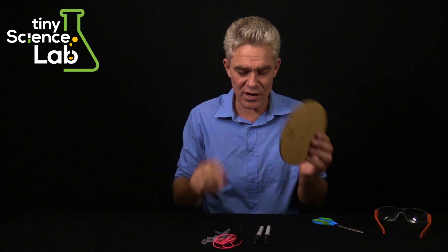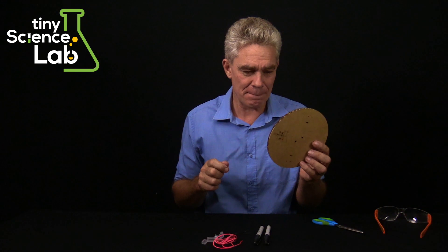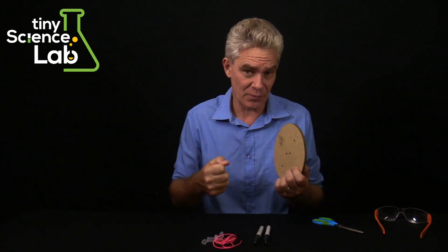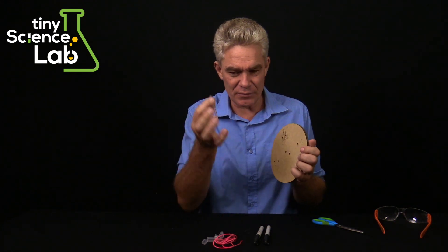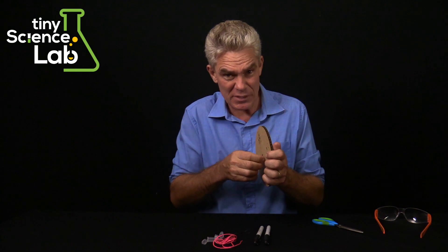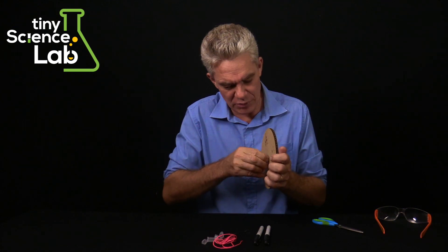We're going to do the trickiest bit first. To make this last a lot longer, we need to put a piece of rubber tube through these big holes, because that's where the string is going to go. Without the rubber tube, the string will bite into the cardboard and it won't last very long. With the rubber tubes in, they're going to last a long time. Take your tube, squeeze the end a bit, and squeeze it in — it's a pretty tight fit.